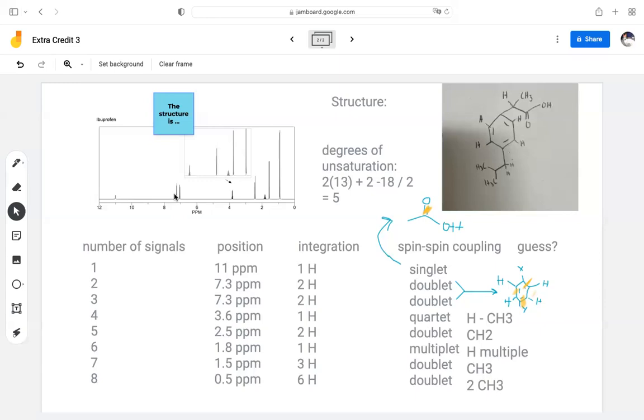And then also with that position, we know normally that with the positions of X and Y here, those functional groups are going to be there. And those positions are based solely on the upfield and downfield placements of the NMR. If the carboxylic acid, which usually is furthest downfield, wasn't, then we would know it to be farthest away from the benzene ring. But again, the carboxylic acid is always going to be between 10 and 12 ppm.